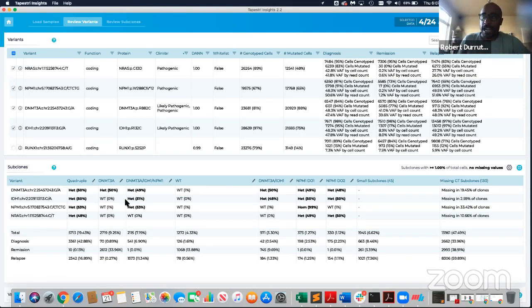What you need in order to actually detect and quantify ADO is a variant that is heterozygous at a given locus. If you have a variant that's called homozygous and one of the alleles drops out, you wouldn't recognize that because the zygosity wouldn't change. And so therefore, this is your largest clone. Because every single variant is heterozygous, by definition, a cell inside that clone cannot likely be the result of a dropout, because you in fact are able to amplify both alleles that would generate your heterozygous mutant call. I hope that makes sense.